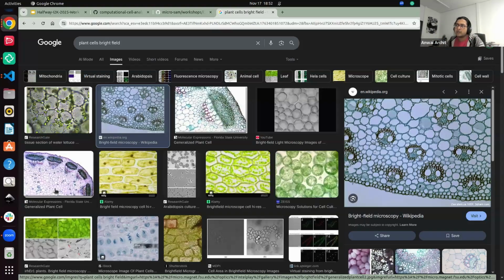I wouldn't opt for instance segmentation because I have a feeling annotating mitochondria in confocal would be a bit too painful, and I don't think it's even realistic to do that. If you're identifying the mitochondria or the mitochondrial structure in confocal images, I'd opt for the semantic segmentation track, wherein you just treat this as a foreground background task. For this one, we have tried a few experiments, and Microsam does a pretty good job for this as well.